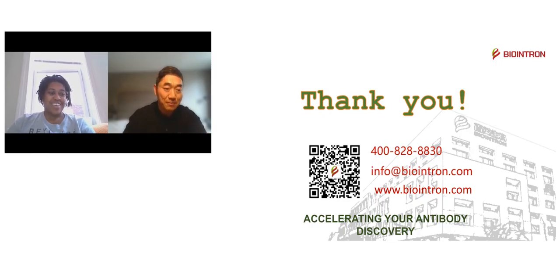Absolutely. Okay, and then I think the last question that I see is, why did you use the mouse as the benchmark when you used rabbit to produce the antibodies? Is there an advantage or disadvantage to that strategy? I think that's from case study 6.